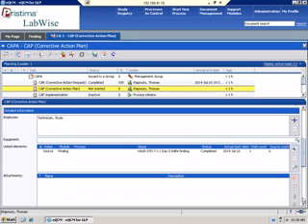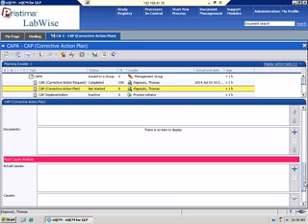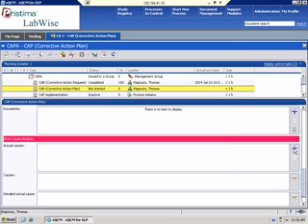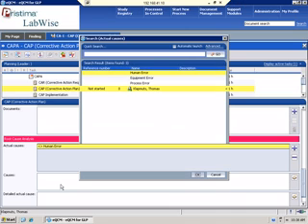As I go through the study technician, there's the finding, and then I need to do a root cause analysis. So here I have some defined, what's the cause? Human error, equipment error, process error. Again, you can define the pick list.